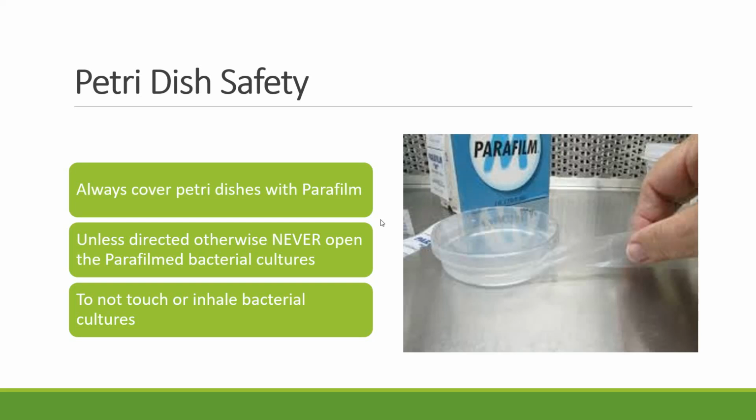You can take a Petri dish, which has two components, so it has a lid that goes on it. And if you take the bottom of the Petri dish and turn it upside down, the agar is not going to spill everywhere. In fact, if you actually push on agar in a live lab or a wet lab, it's going to feel very much like Jell-O. So it's got some resistance to it. You push too hard, and yes, you can break the surface. But we oftentimes work with Petri dishes. You will see them in various types of clinical and lab settings.